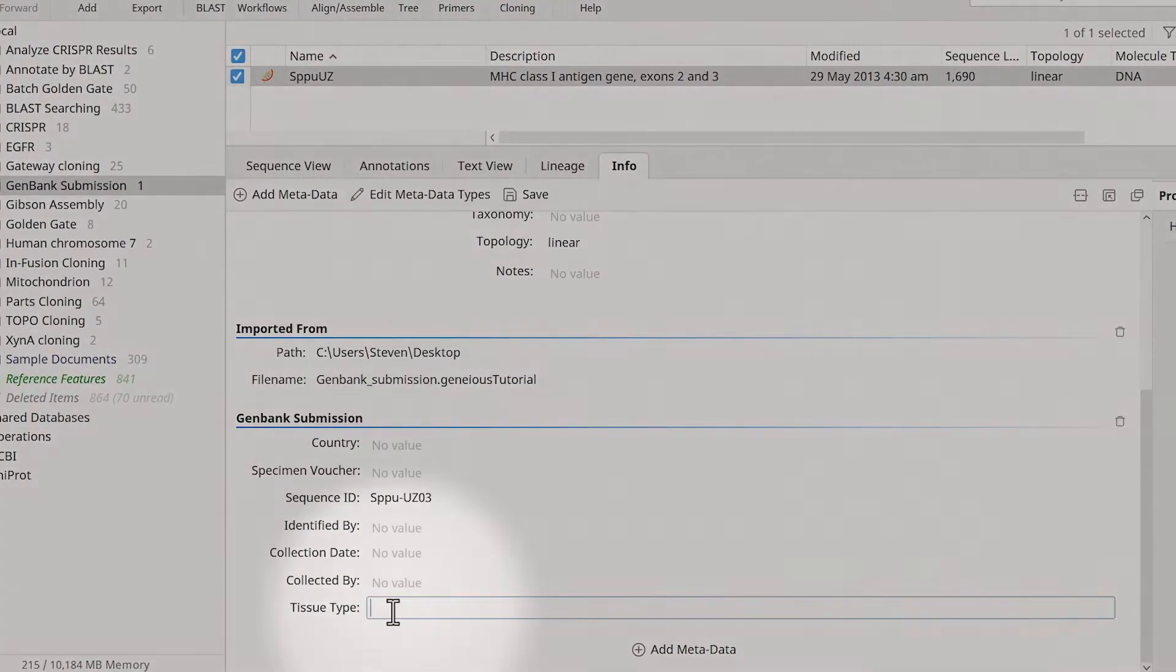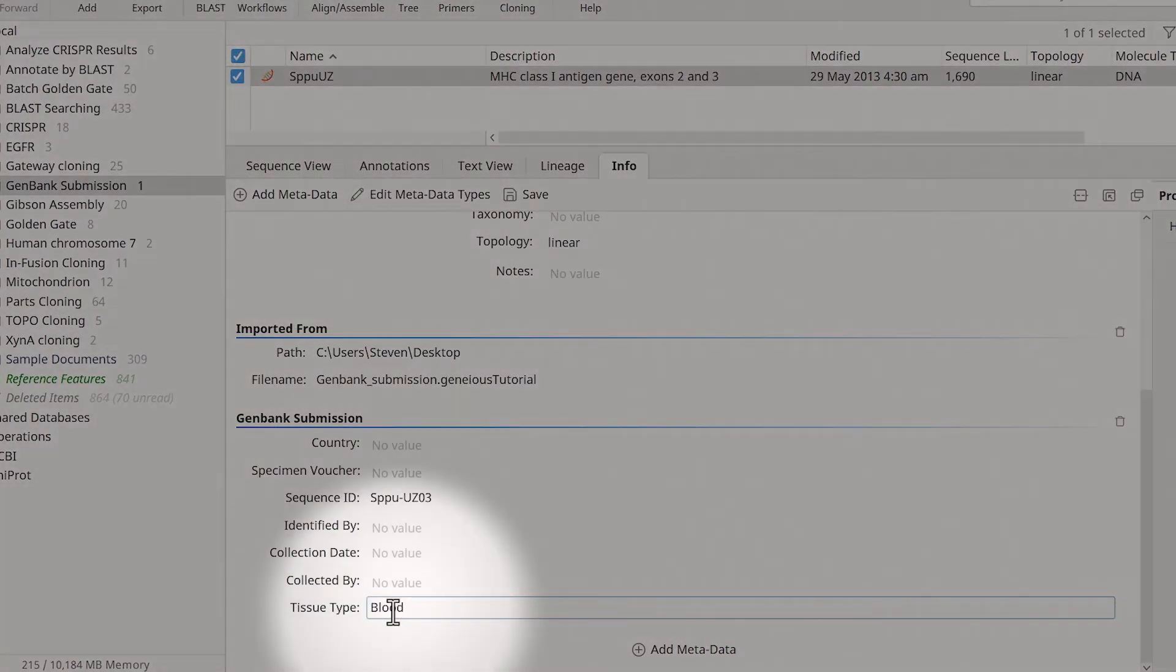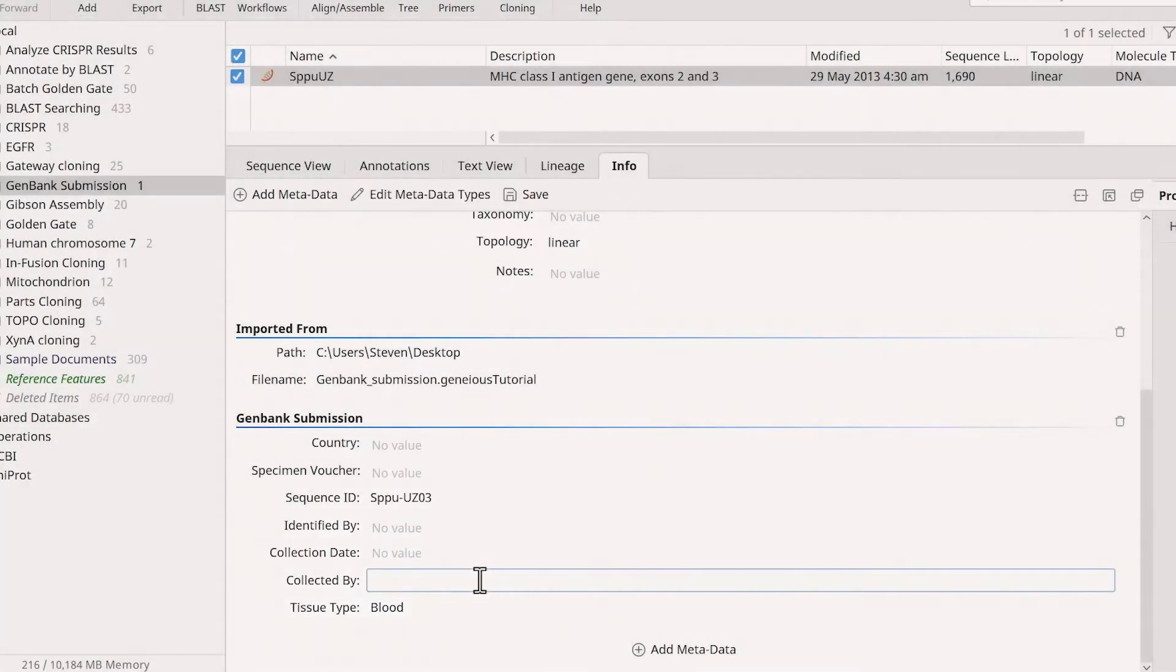You can now populate the new field. Once you're happy with the metadata, click Save.